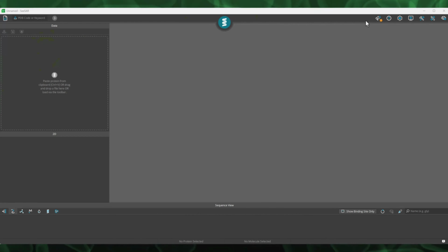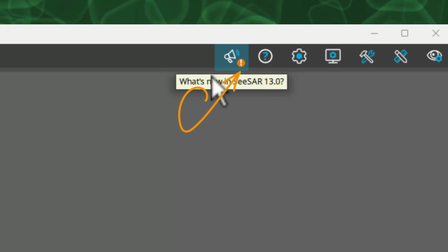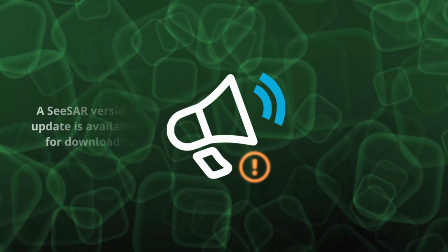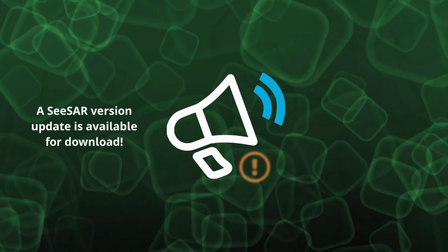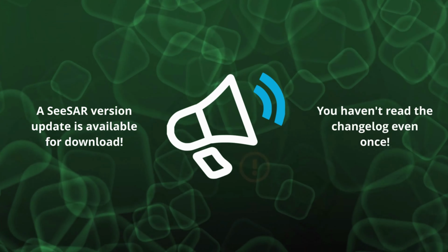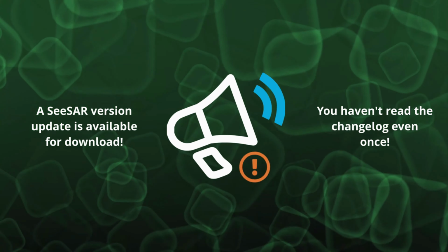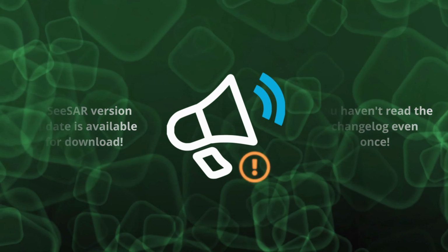But that's not all. We've added a thoughtful touch to the bullhorn icon. It now features a notification dot, serving as a friendly reminder for two scenarios. The first scenario is when a new SeeSAR version is available. The notification dot will appear, signaling that an update is ready for you to explore and download. The next scenario is if you haven't clicked on this bullhorn icon to read the changelog even once. The notification dot gently reminds you to check the latest updates and discover the exciting enhancements we've made.